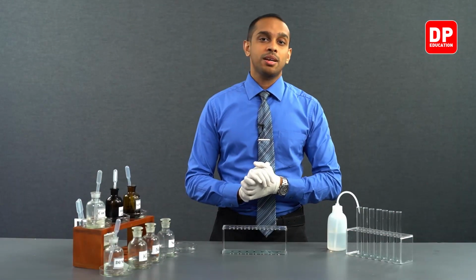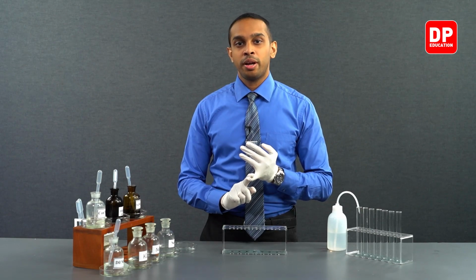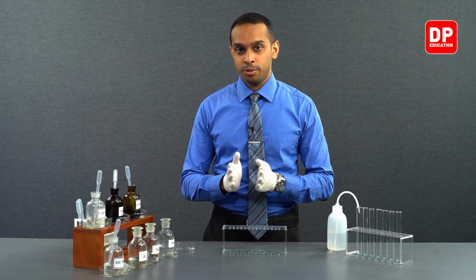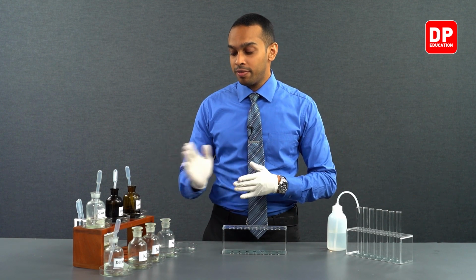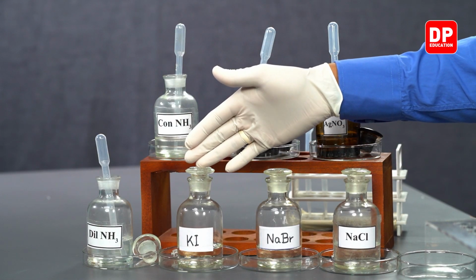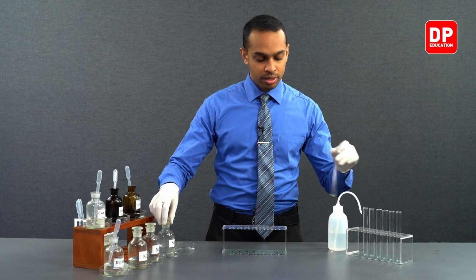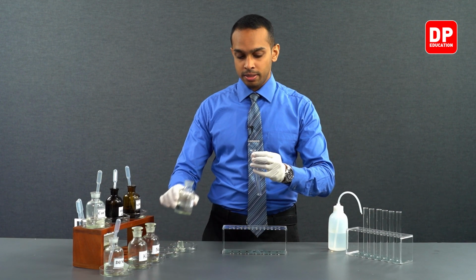Now, let's compare the colors of the precipitates of silver chloride, silver bromide, and silver iodide. To do that, like we did before, we will now be adding silver nitrate onto sodium chloride, sodium bromide, and potassium iodide. So first of all, let's take a small test tube and take a little bit of sodium chloride.